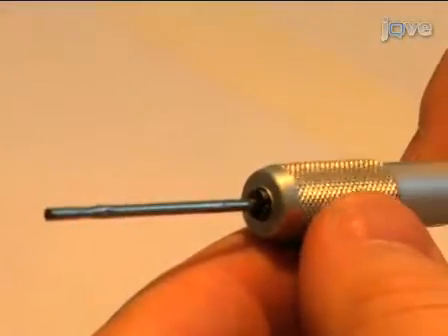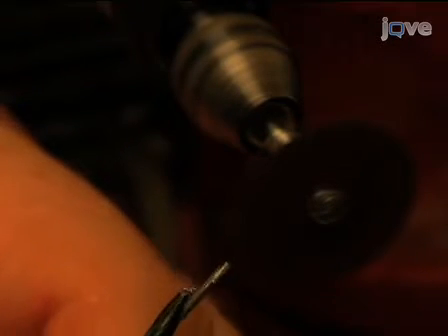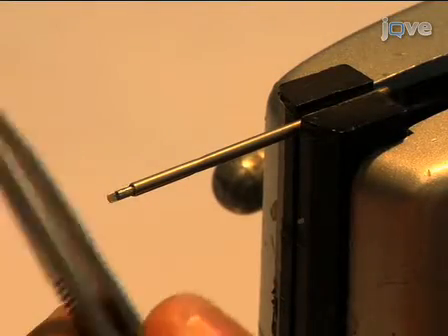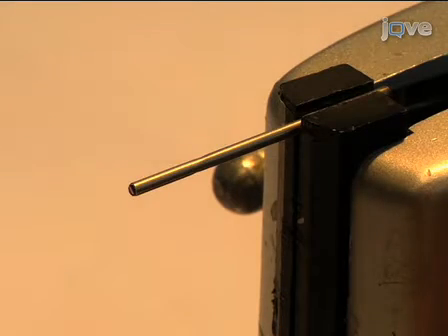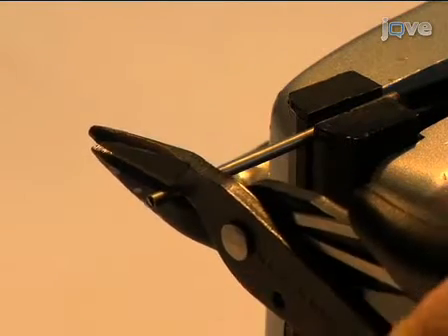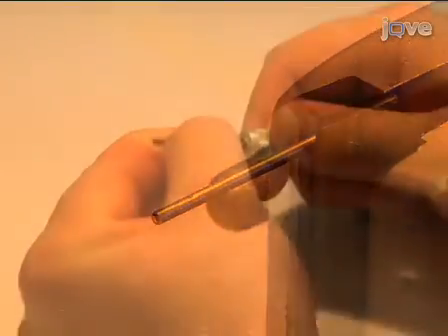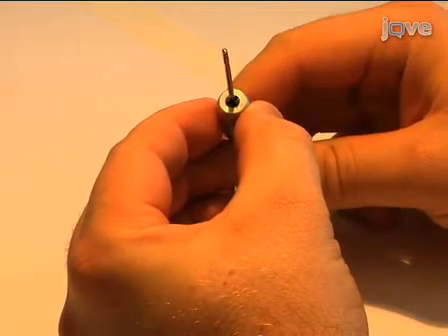Before we can make the microdrives, we need to make a screwdriver to turn our custom screws. Our makeshift screwdriver is constructed by taking a custom screw and completely grinding down the lip that surrounds the half-cylinder head. Insert the screw head first into a 5 cm long 15-gauge tube until it is fully encased. Now, crush the tube around the threads of the screw, securing it in the tube and preventing it from turning. Attach a mini pin vise to act as a handle and voila, a screwdriver.